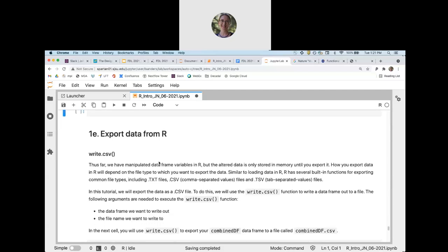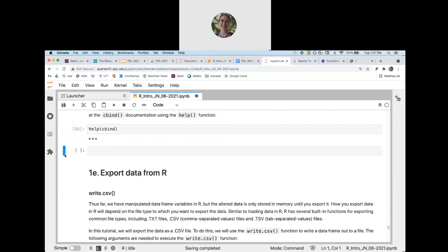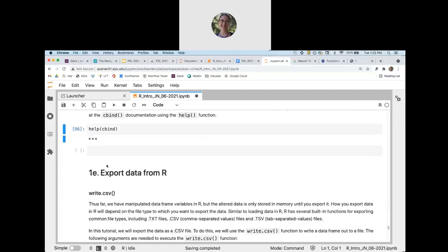If you click on the blue tab on the left, it will hide output after you run it. Yes, that is a good point. Thank you, Emily. You can just double click over here on this blue bar, and that will hide the output as well. Very good.